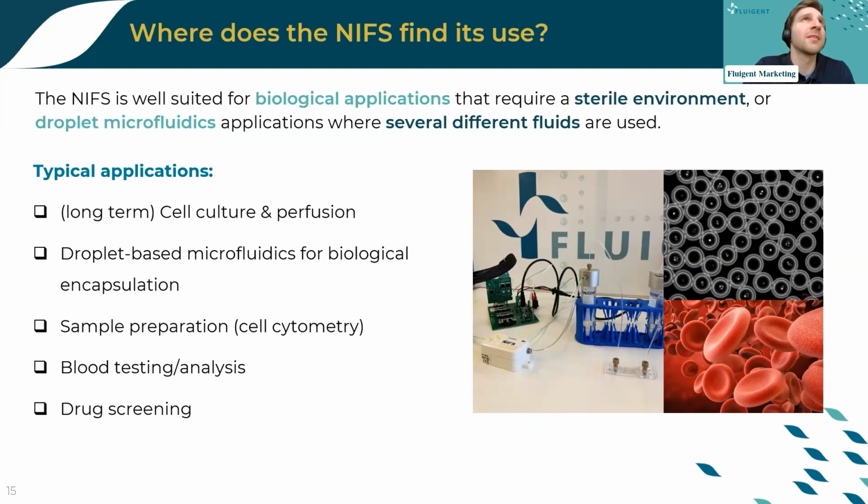So if we're making a measurement for 24 hours, 1 day, 2 days, the flow sensor will never be in contact with your liquids. So it usually reduces the risks of having some failure in your systems over time.